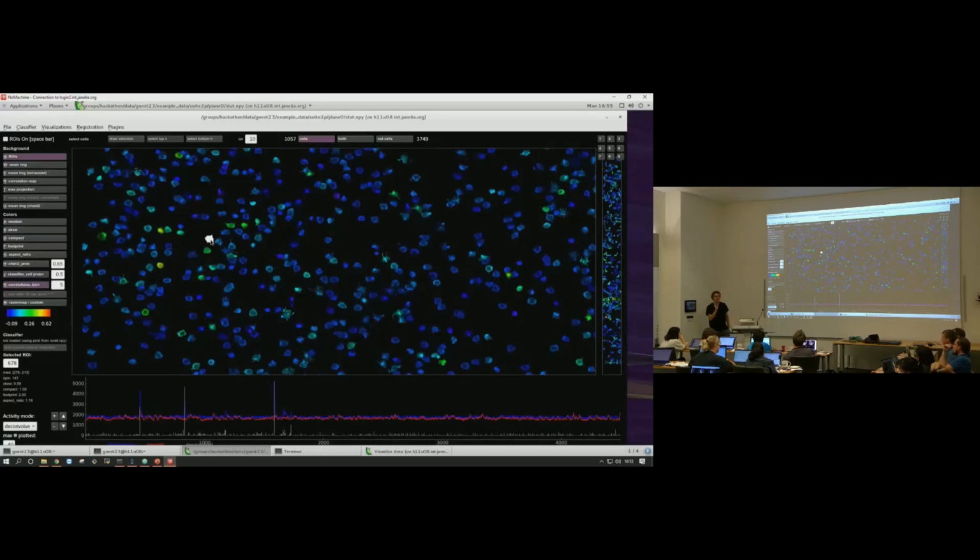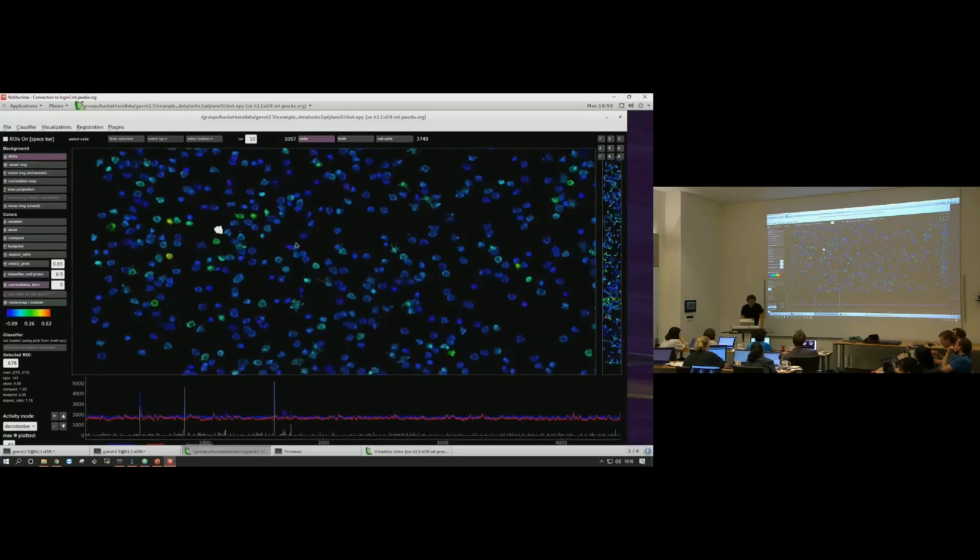There's only one parameter really that you're setting, which is the decay time scale, and by default it will be the same for all of them. Yes. One of those papers that I put up there at the beginning is where we try to see how bad the deconvolution gets if you're wrong about your time scale by a factor of 2 maybe, or 3.